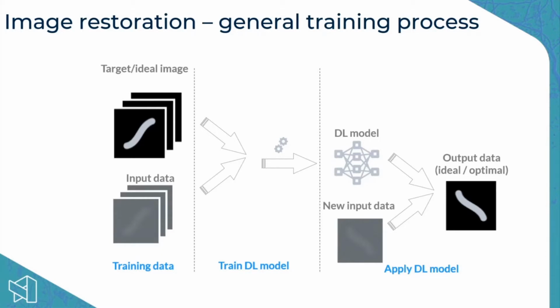But if you do that with low laser light in order to keep the sample healthy, you get pretty rubbish images. So that's your input data, this rubbish image that doesn't hurt the sample, if talking about live imaging. But we can then convert that to the target data, which typically is done with a fixed sample, so that we can get the very best possible image quality.